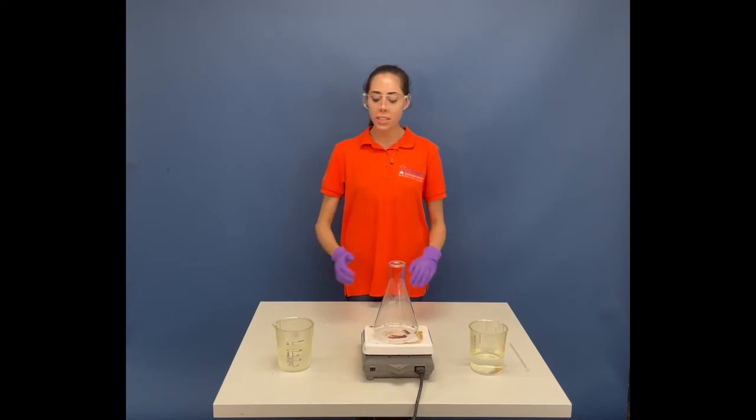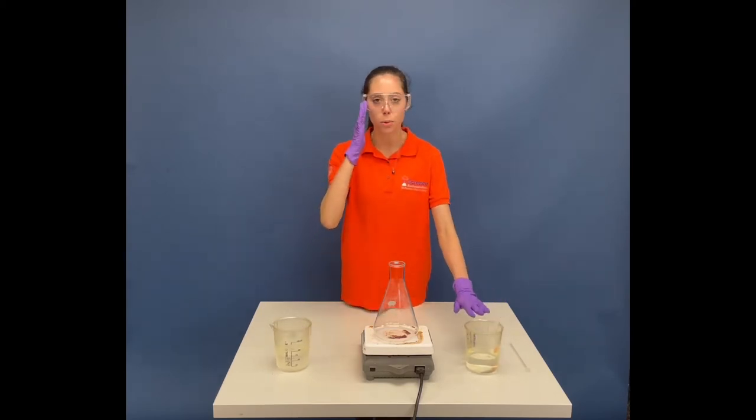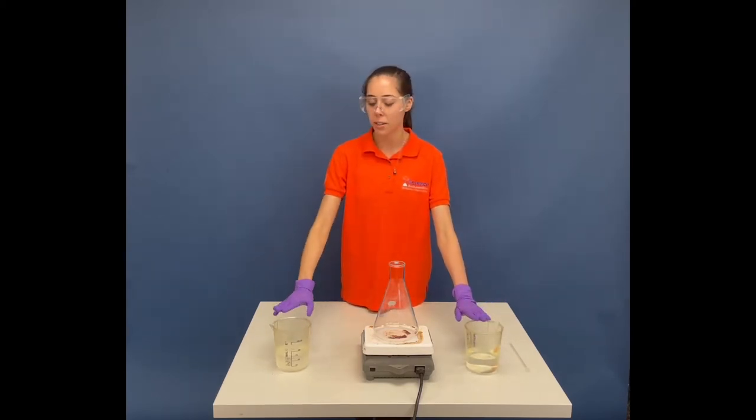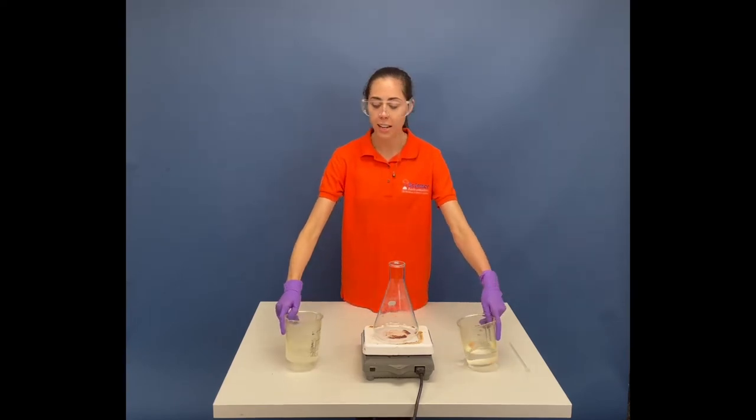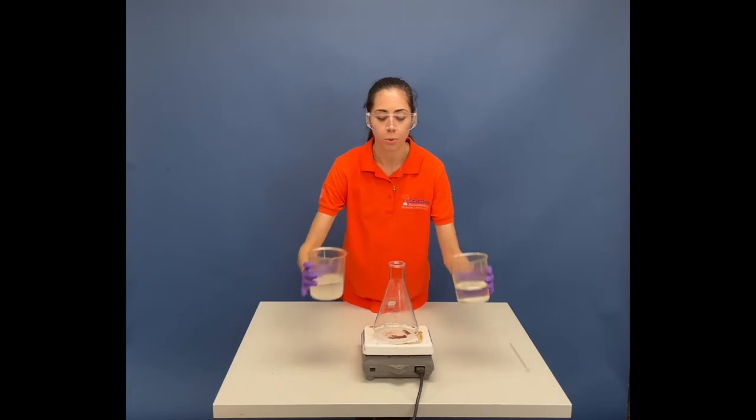So I have these two beakers here of different chemicals. I'm not going to go into too much detail about them, but we're just going to call this beaker A and beaker B. Both have different chemicals inside them, and I'm just going to pour them in.